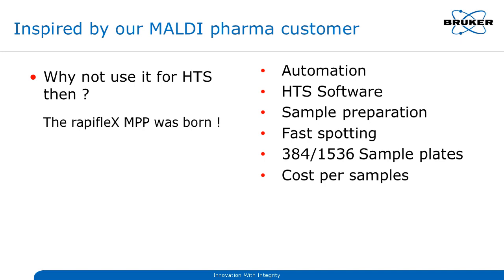As you saw in the imaging example, it does not take more than 10 hours anymore to do an imaging experiment, but still about half an hour. In consequence, sample plate exchange is manual. A 1536 sample plate takes between 8 and 10 minutes, so about 1,500 plates for a 2 million sample screen. Manual exchange is no option anymore. Therefore, we have developed a new sample feed mechanism which allows fully automatic sample exchange by robot systems.